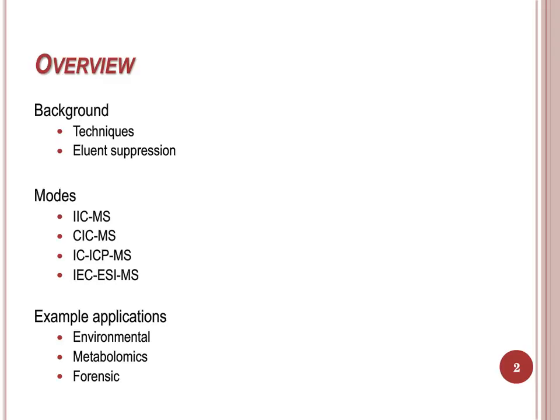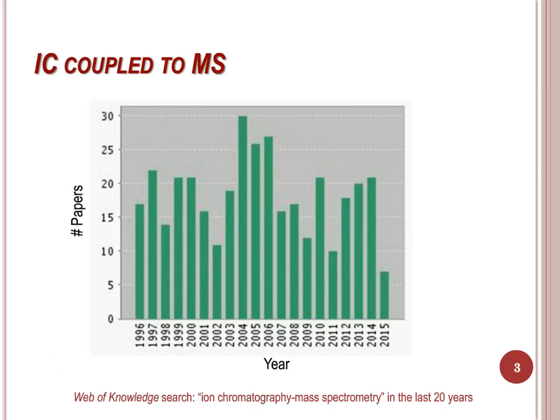ICMS has been growing in interest in the last few years. Although not the most accurate search, this slide shows that hyphenation of IC to MS is not a new concept. And with the recent advances in the technological side of both IC and MS, coupling the two techniques together is increasing in a wide range of scientific fields, from pharmaceutical to forensic to environmental.